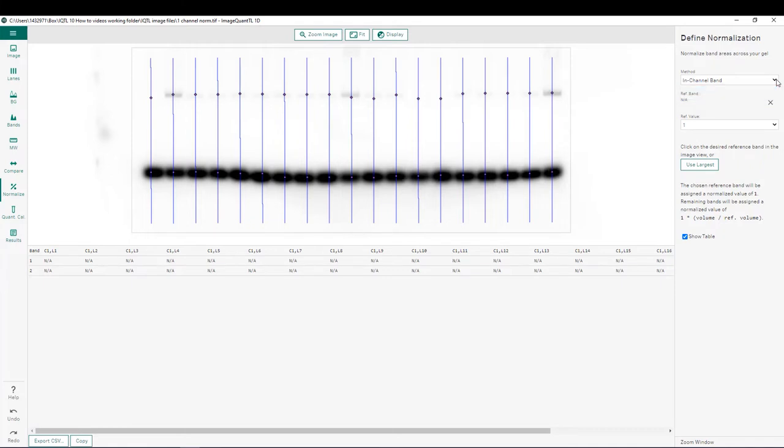Next, we can choose which band we'd like to use as our reference band. For this image, I am going to choose the loading control from lane one as my reference band.